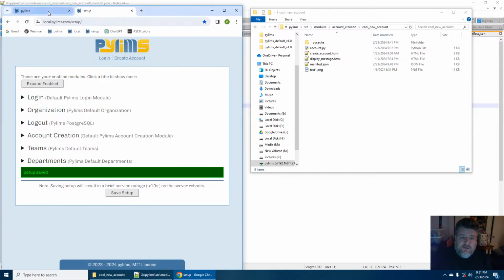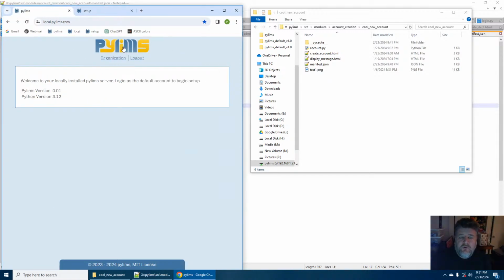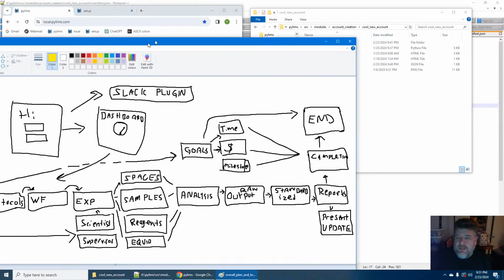So going back now to this page, you log in. Some links are up top. I'll do some other stuff later with this. It's just placeholdery for now. But what I've worked on, maybe I'll pull up my overall plan.